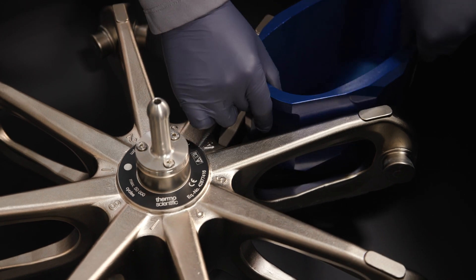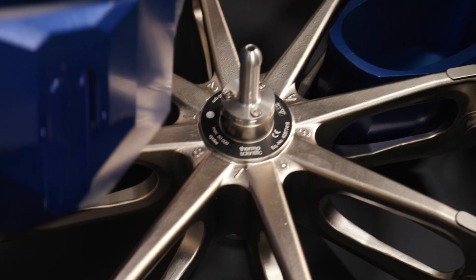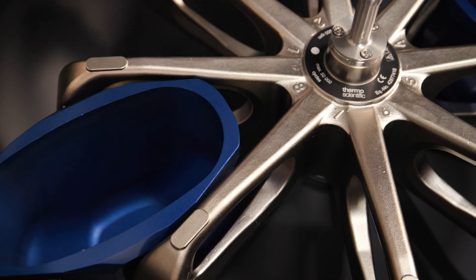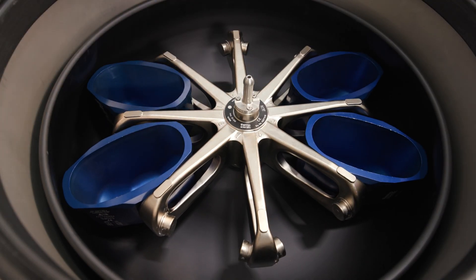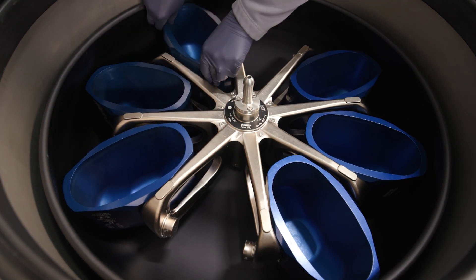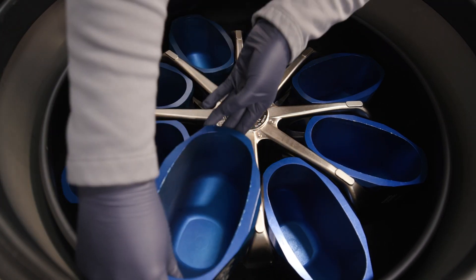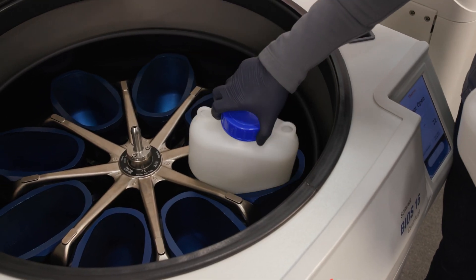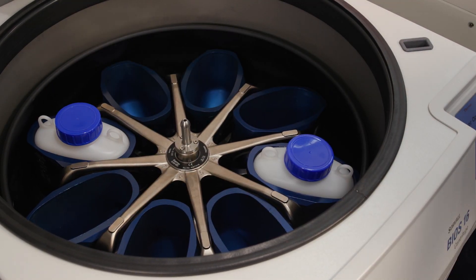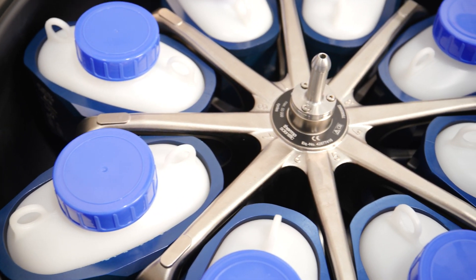Next, install an empty bucket in each position. Buckets with the same weight class should be in opposing positions. Make sure each bucket swings out freely on its rotor trunnion bolts. Always use a full complement of buckets even if some stay empty. Load the buckets evenly and balance opposite loads. Incorrect loading can lead to damage. Always load the rotor symmetrically to avoid imbalance, bumpy spinning, and damage.